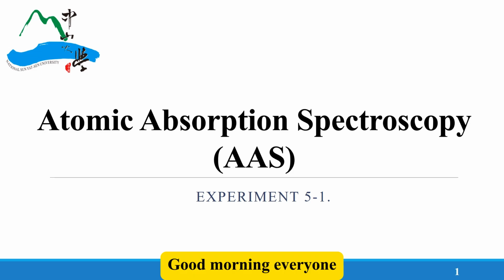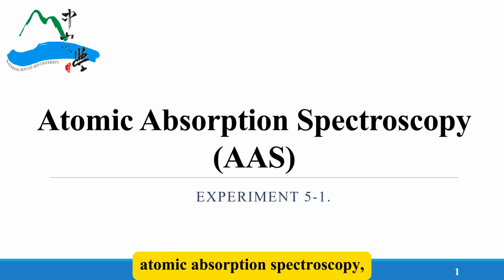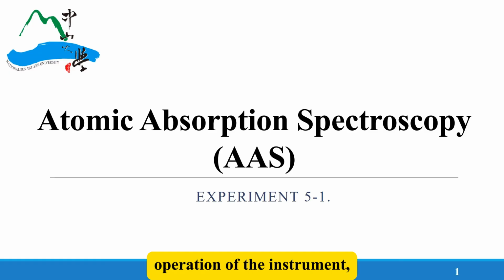Good morning, everyone. Today, I will present Experiment 5.1, Atomic Absorption Spectroscopy, commonly known as AAS. In this experiment, we will learn the fundamental principle, operation of the instrument, quantitative analysis methods, and interference effects in atomic absorption spectroscopy. We will also apply this technique to determine the calcium ion concentration in water samples.